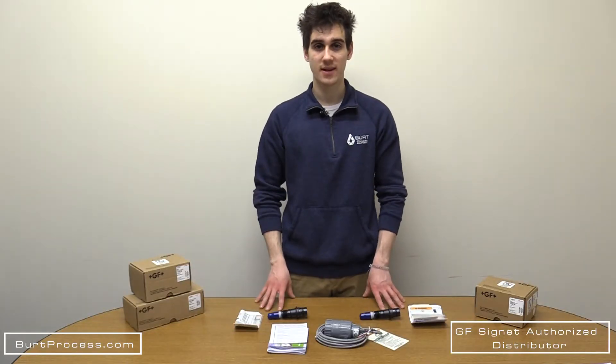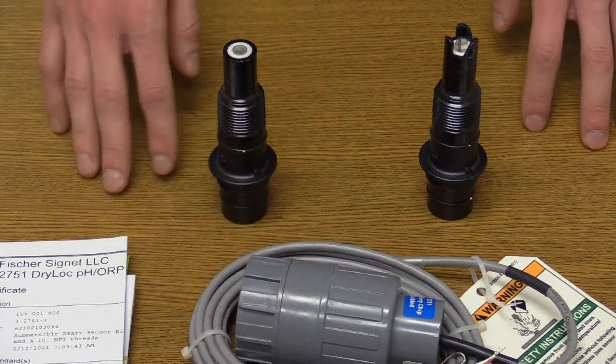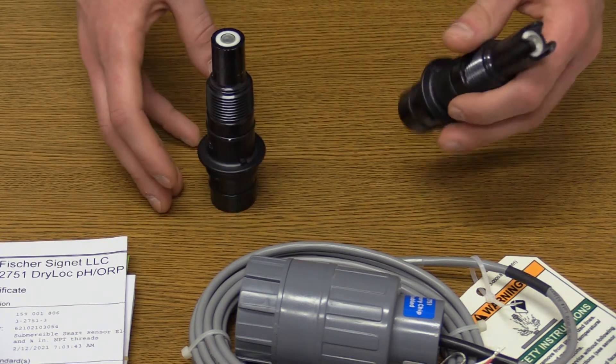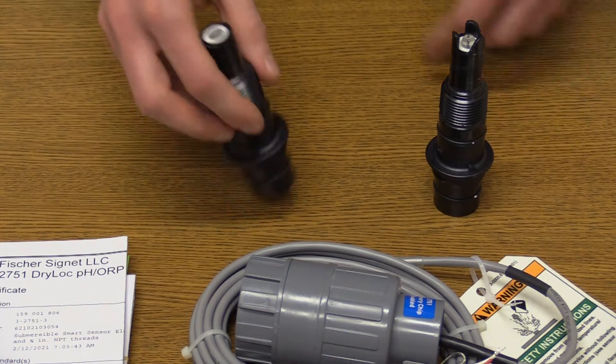We've unboxed these three products — let's take a closer look. Here we have the 3275-1 smart sensor electronics, the 2724 flat style electrode, and the 2726 bulb style electrode.